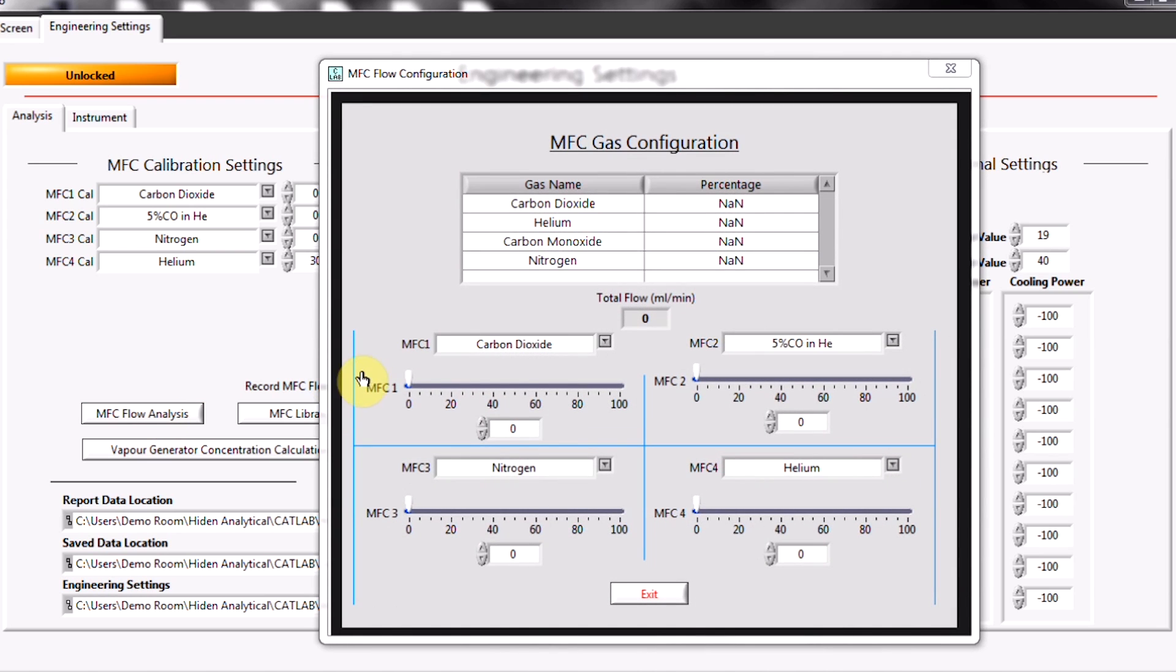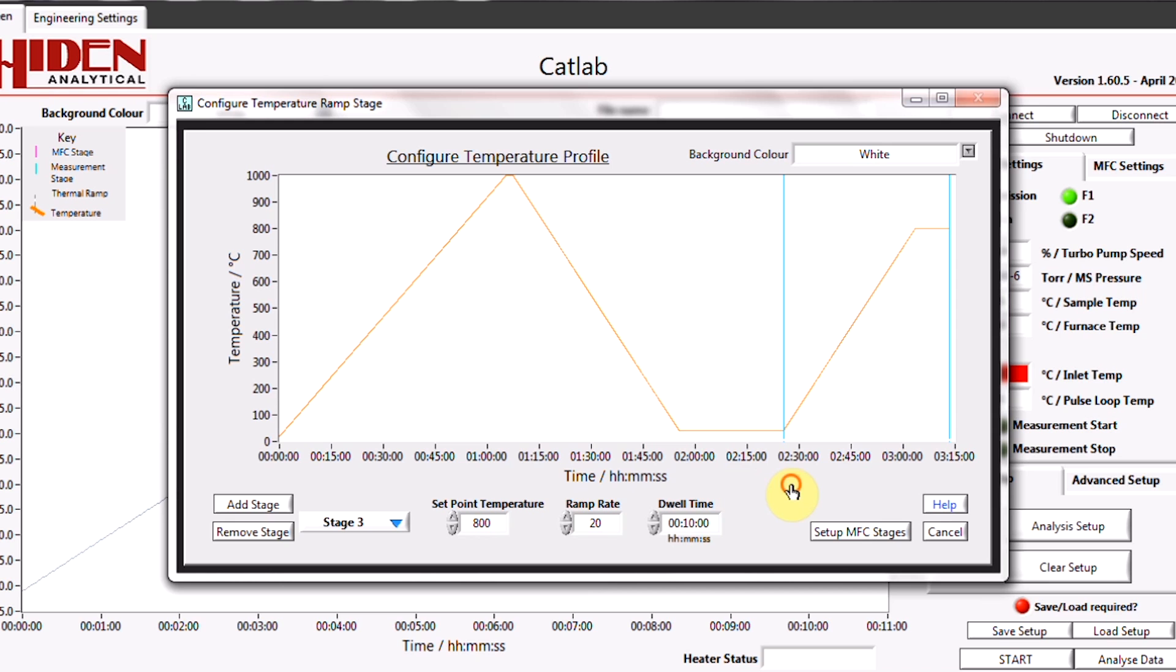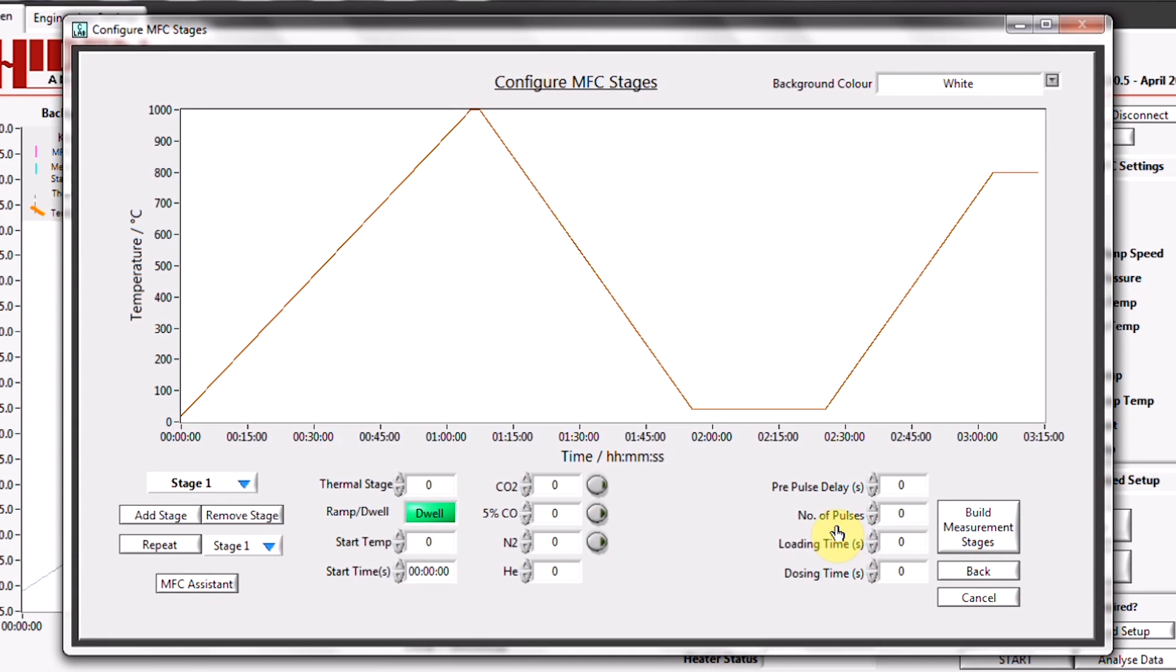All system control parameters including gas flow, temperature control and mass spectrometer settings are integrated in the CATLAB software package.